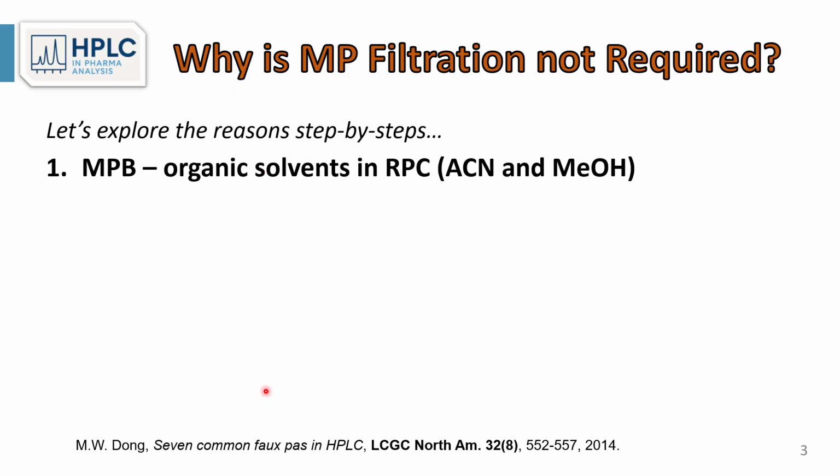First of all, mobile phase B, which is organic solvents in reverse phase chromatography, is acetonitrile and methanol. In these cases, HPLC solvent grades are generally used, and they are pre-filtered by manufacturers.